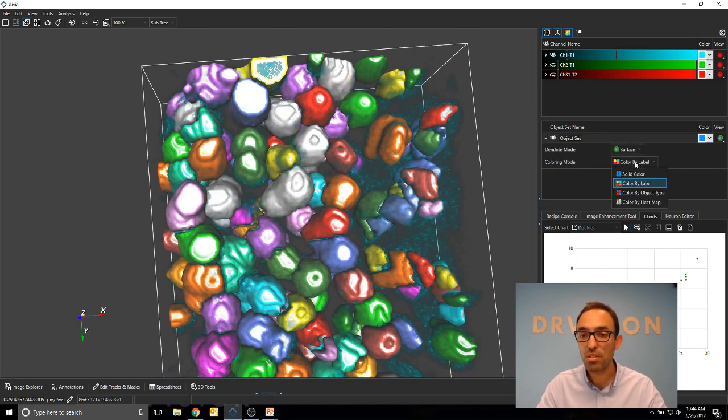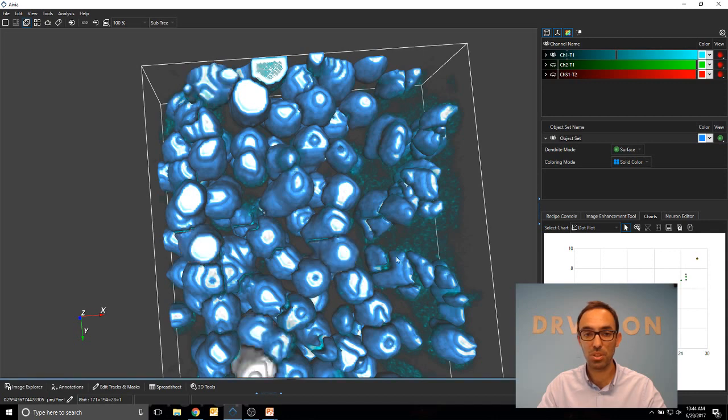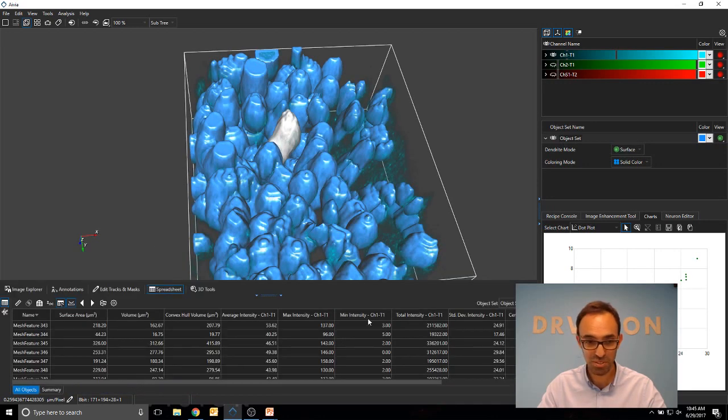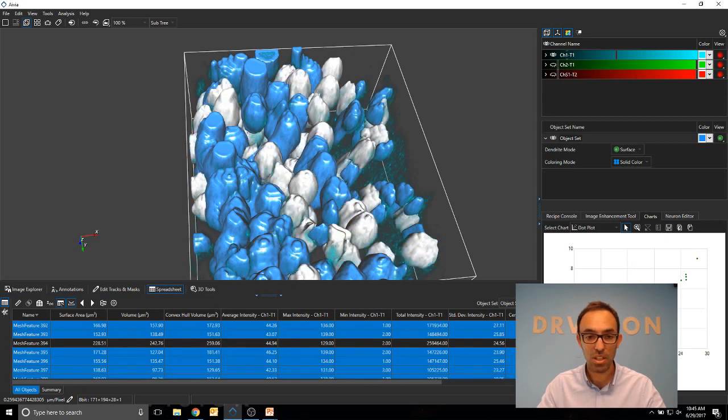I'll change this. Okay, so you can see if I select a group anywhere on this graph, it will illustrate which one I'm looking at. Also, if I select it directly from the image, it will also highlight it both in this spreadsheet, which sometimes is hard because the dots are relatively small, and also in the spreadsheet below. So these three views are connected up, which is very useful sometimes.